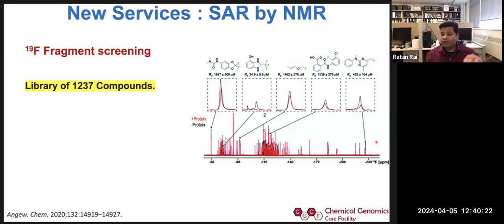In silico, we can confirm, okay, this is the one binding site, and for the other, this is the second binding site. From there, we can have some kind of chemistry involved, because it's complementary. There will be no replacement. But I will say in silico modeling and NMR are going to complement each other when you don't have any structure. Suppose you have not solved the structure of a protein, then at least you should have something to look at.